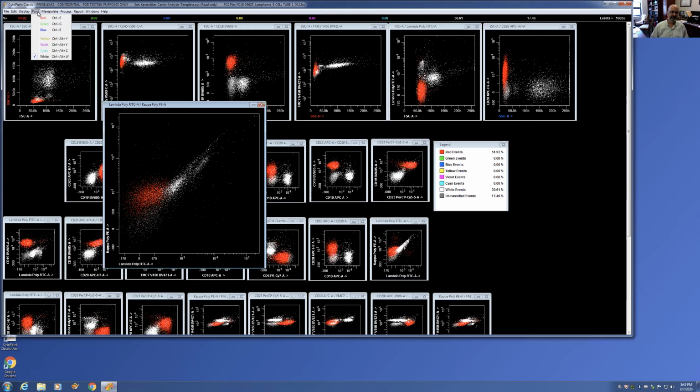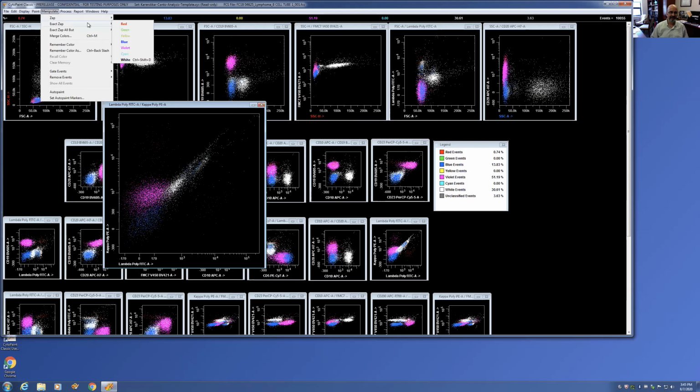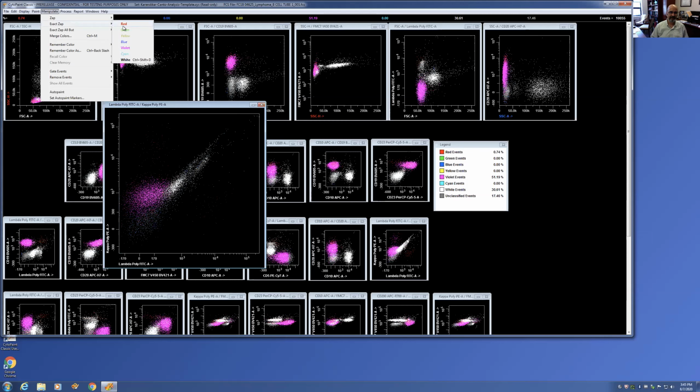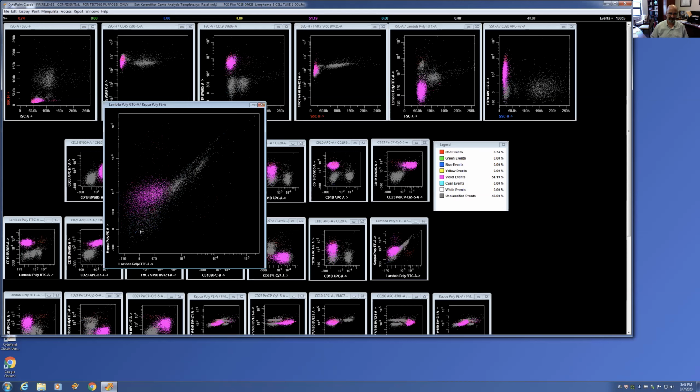So just for us to be sure, if you did a Kappa Lambda ratio on this whole population, you can take a different primary color and overwrite one side. So whatever was red turned violet, and then you can just subtract the blue population away, and I'm going to subtract the white population away as well. So you saw this overall Kappa to Lambda ratio very, very high. So see, this is 51% down to 0.74.